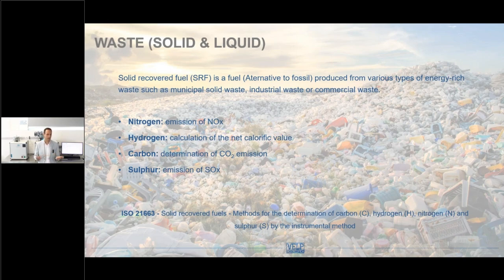According to ISO, it's very common to perform a full CHNS determination. Hydrogen is especially useful for the calculation of the net calorific value for power plants, and sulfur, carbon, and nitrogen to determine the emission of these gases in the atmosphere.